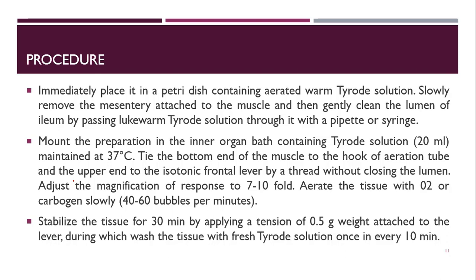Okay, because that ileum may consist of fecal material, so we don't want that fecal material to contaminate our tissue or interfere with our readings. That's why we have to clean it internally.